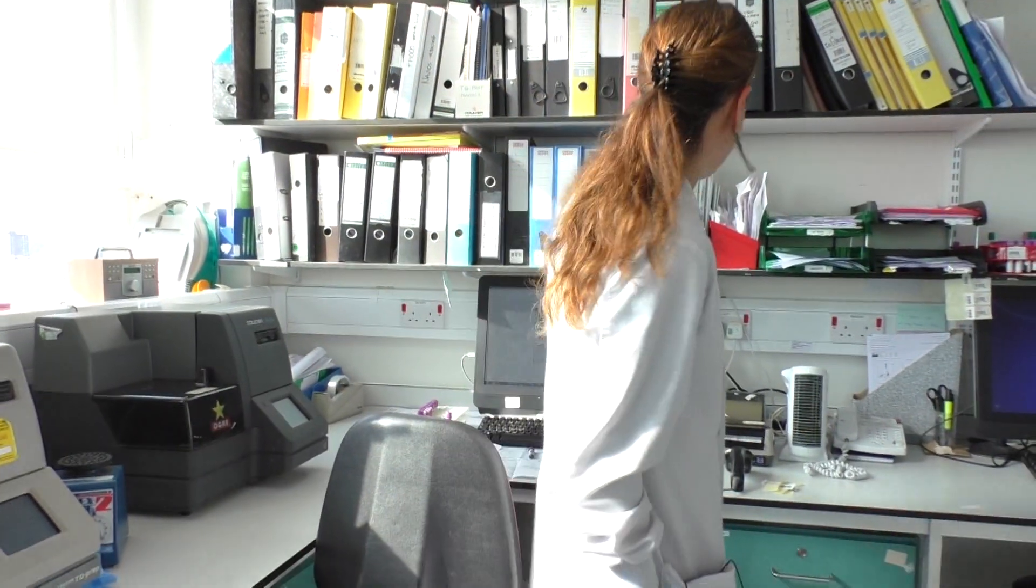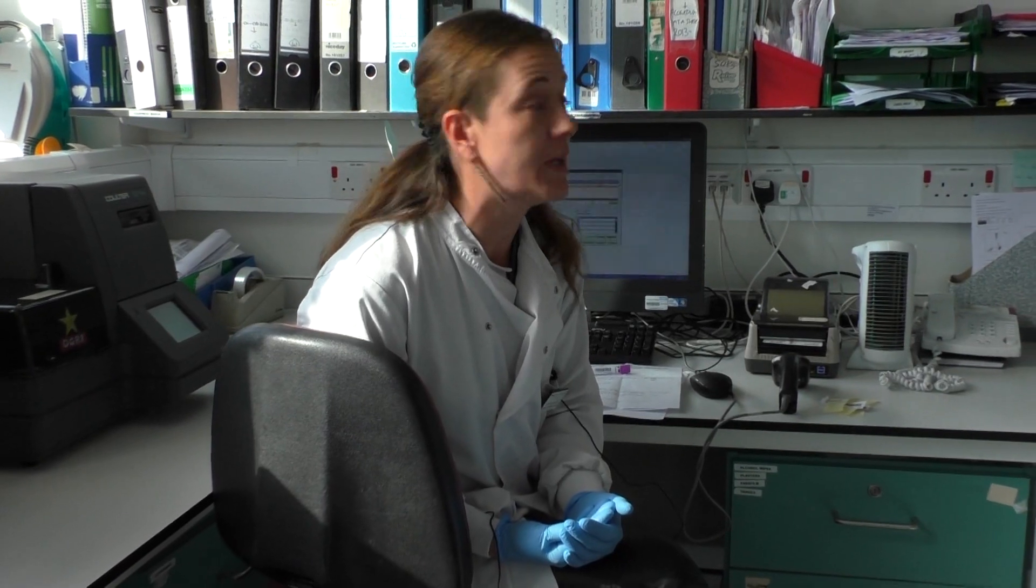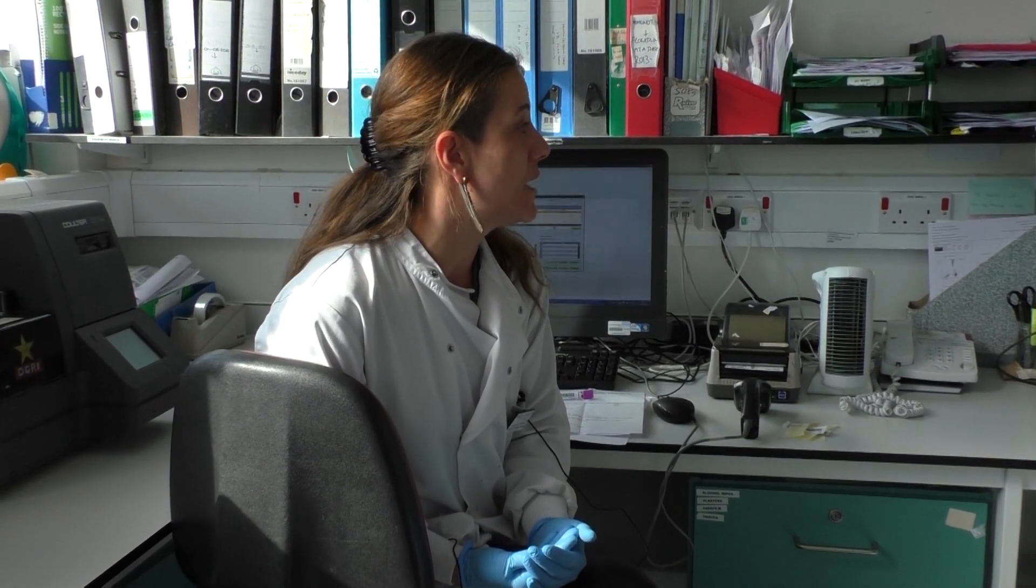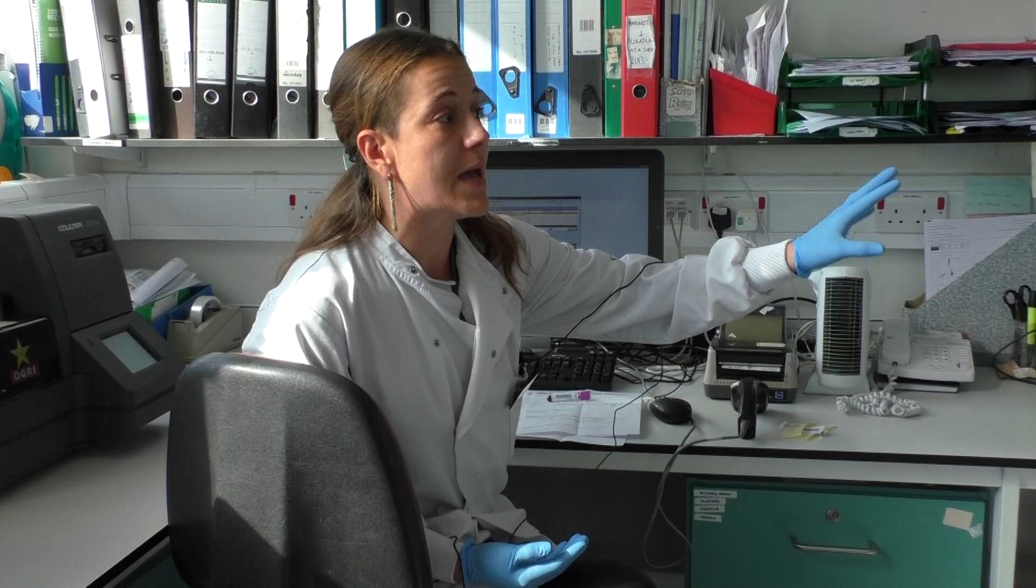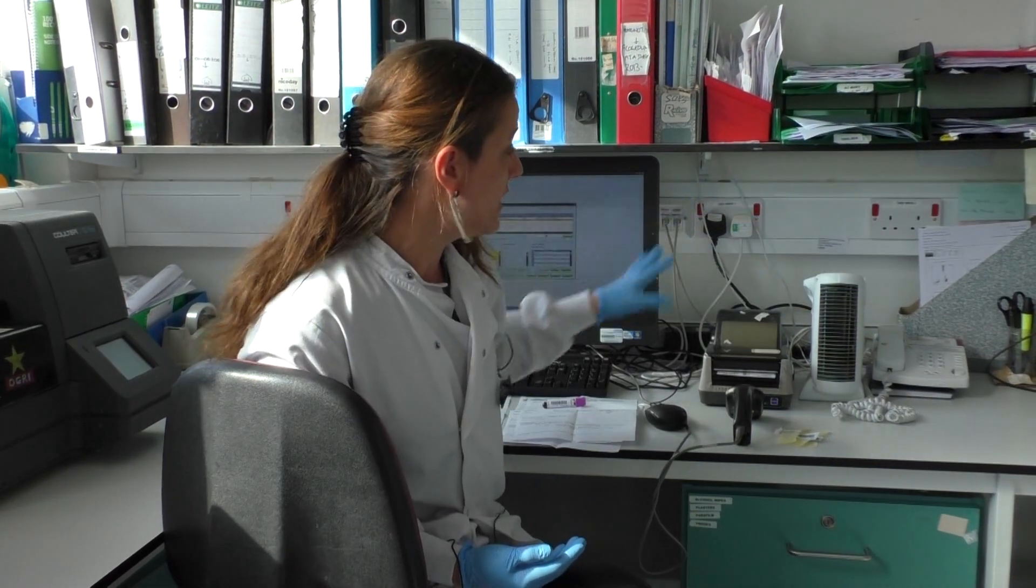Okay, so this is where we receive samples. The flow section actually tests samples for lymphocyte subsets. We do other tests - T cell activation tests and PID panels. We receive the samples in the main reception and then bring them here where we book in our own samples.